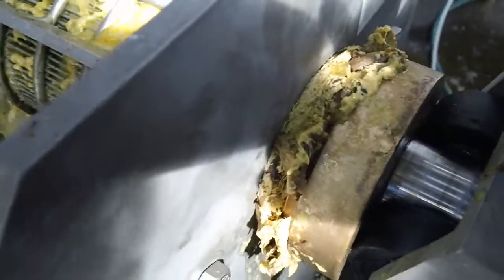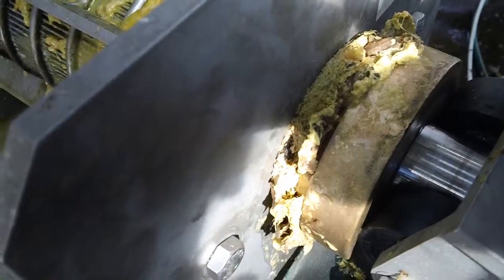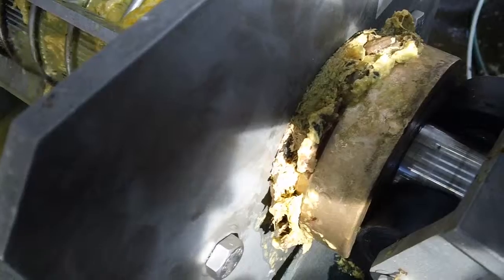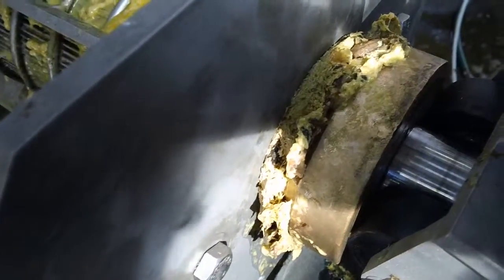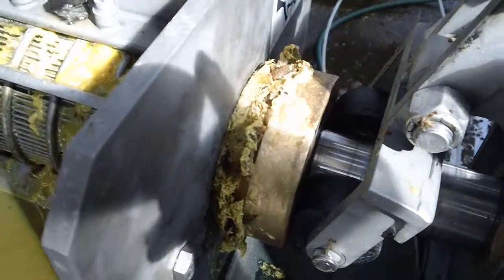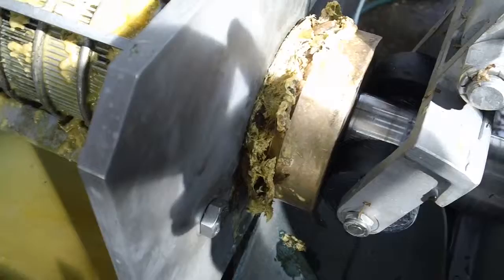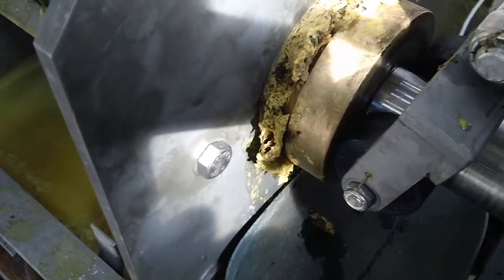The truth is, taking a sample to bake in the oven and give you a moisture content number will be misleading at best, because we didn't calculate or weigh the amount of press aid that we put in for the 2 gallons or so of liquid that was remaining.